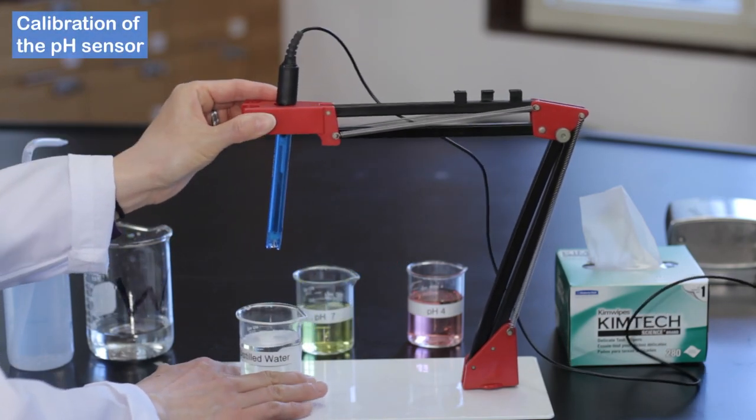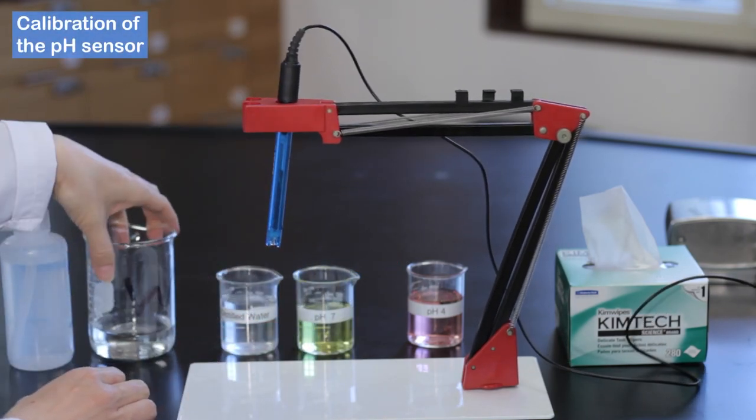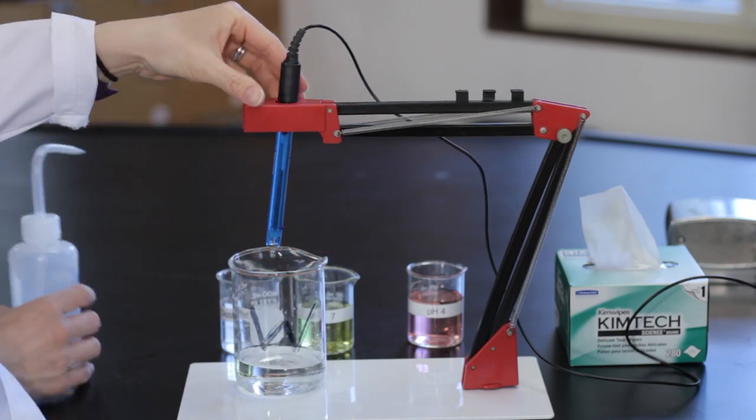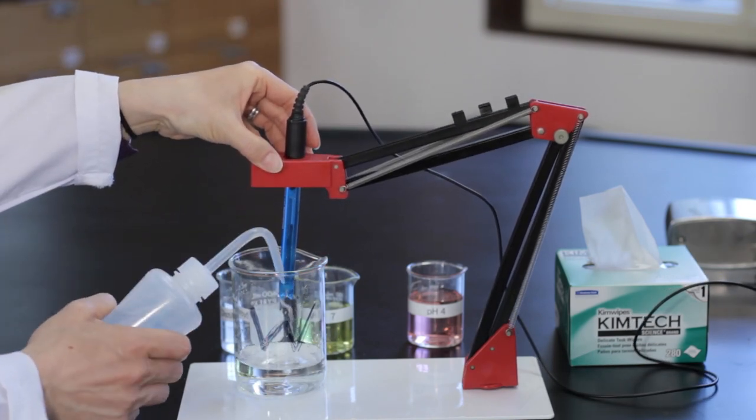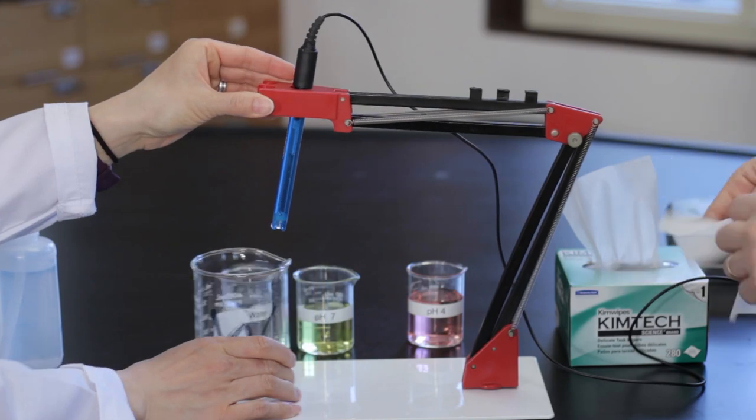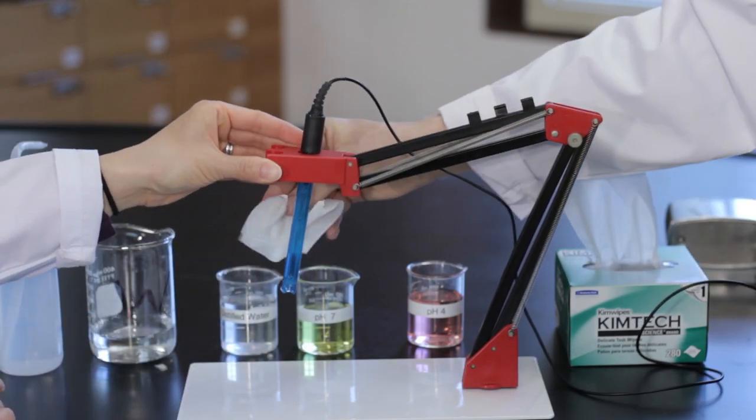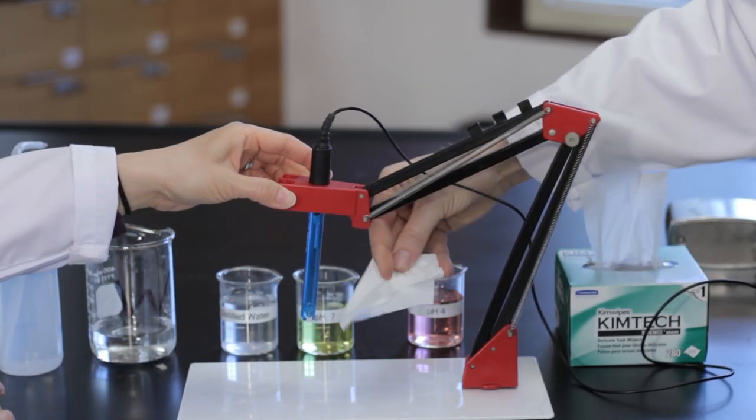To calibrate the pH sensor, rinse the pH sensor with distilled water. Do not collect the rinsings in the distilled water beaker; instead, the rinsings should be collected in a waste beaker. Wipe the pH sensor with a Kimwipe.